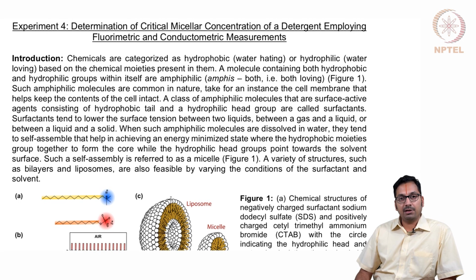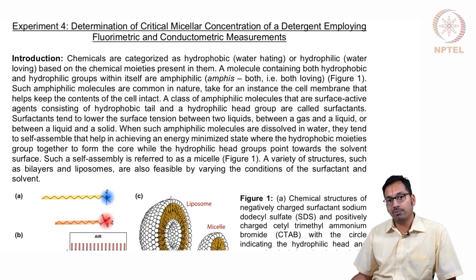Welcome to the last lecture in the third week in the course Quantitative Methods in Chemistry. Like in the last class, we tried to understand where systematic errors could arise from. We took an example of determining the critical micelle concentration of a surfactant, and we ended up using two different techniques to see whether a given measurement is repeatable and whether it's reproducible.